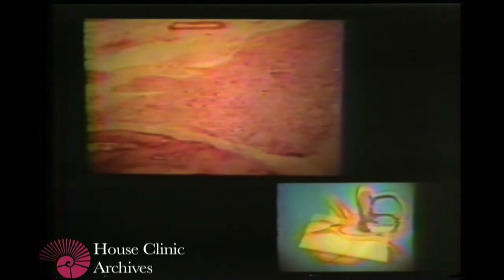This is a higher power of the geniculate ganglion, showing the ganglion cells, the artery that accompanies the geniculate ganglion, the takeoff of the greater superficial petrosal, and again the facial nerve going posteriorly. Here is a cut just below the genu of the facial nerve. We see the facial nerve in the internal auditory canal. The genu would be just superior, and here is the beginning of the fallopian canal.